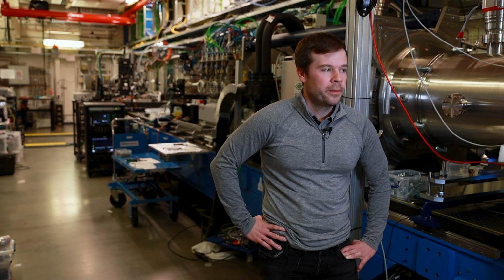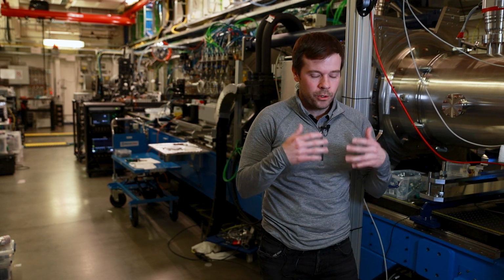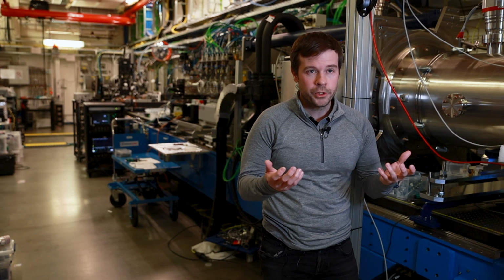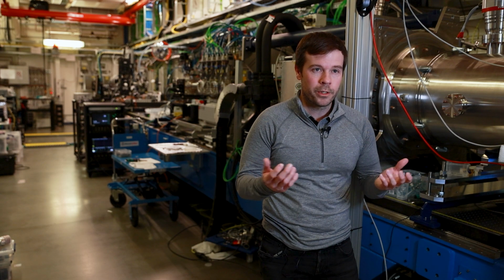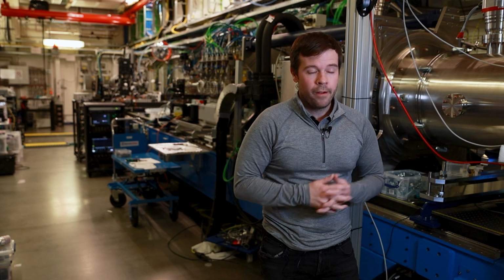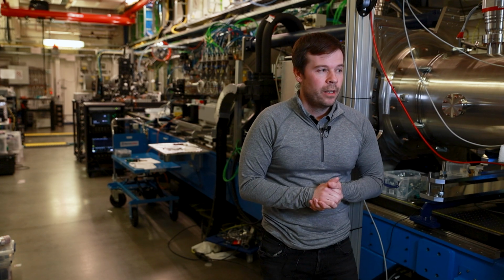So in this experiment, we aim to extract structure from phycobilisomes by doing single particle imaging. And previous single particle imaging experiments were done mostly in aerosols because you get a large background due to the solvent. In this case, water or some aqueous buffer.